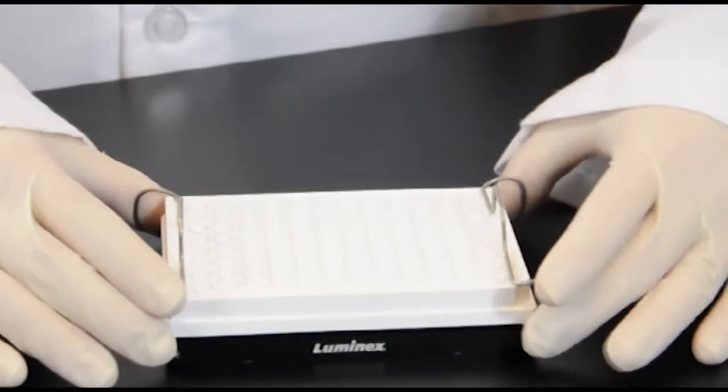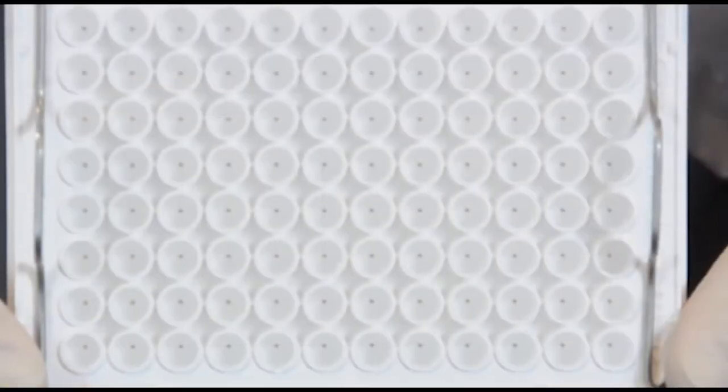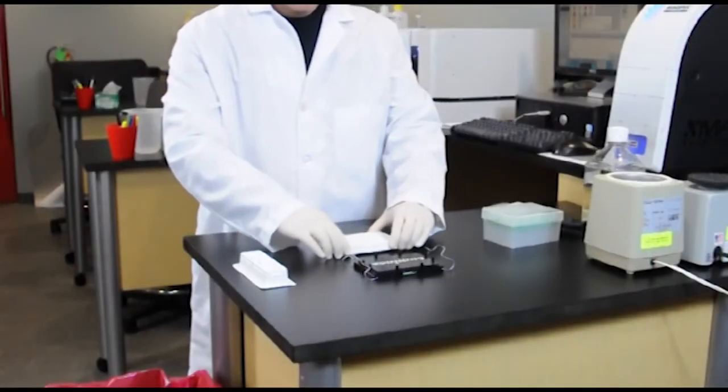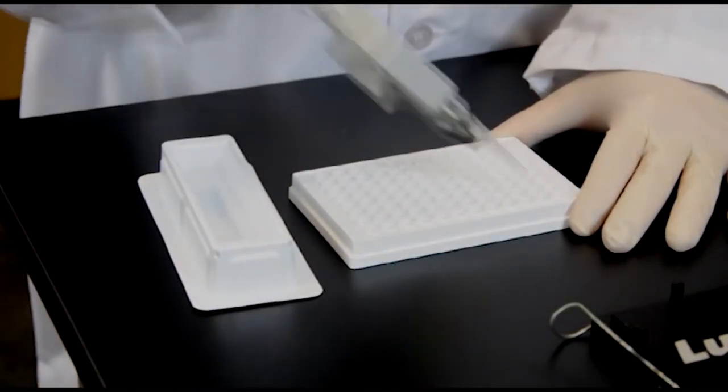You may see the MagPlex Microspheres at the bottom of the well depending on the plex and concentration in the assay. Once the assay plate is removed from the Magnetic Separator, liquid reagent can be added back to each well as part of a wash step or to proceed with the next reagent addition in the assay protocol.